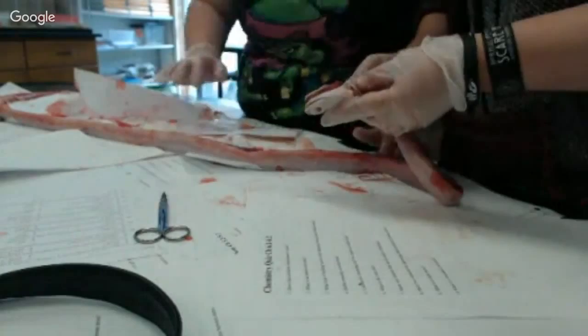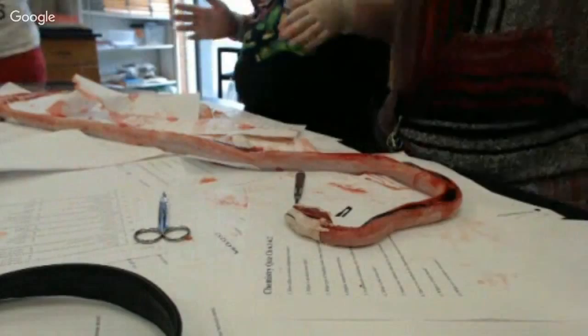That's true. Time's up. So done. It broke. It wasn't me. What? Scalpel. Yeah, they're made to break. You're fine. They're made to break, that way no one gets hurt.